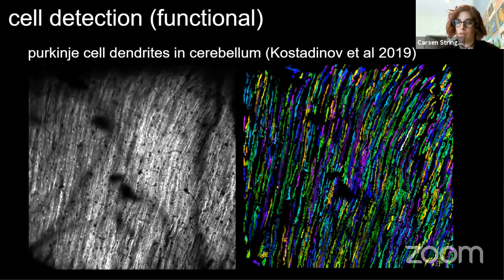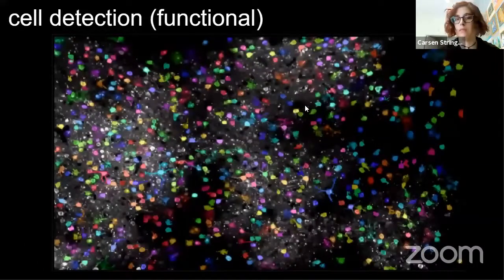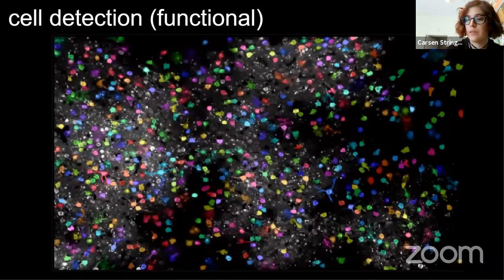All right, so the first question is, yes, we have annotations on the cell. We return for the user the image, which would be these masks, a list of masks: this mask is these pixels, this mask is this one, and so on. But we don't have anything native in Suite2p. There are GUIs built outside of Suite2p that we have linked on our website that allow you to match across days and track those cells. But that's currently not in Suite2p natively inside the algorithm or the code. But it's definitely doable. Then the question is whether cell detection is manual, semi-manual, or fully automatic.